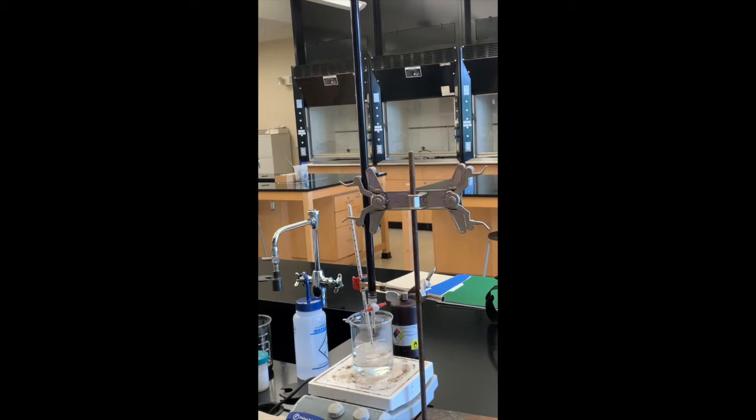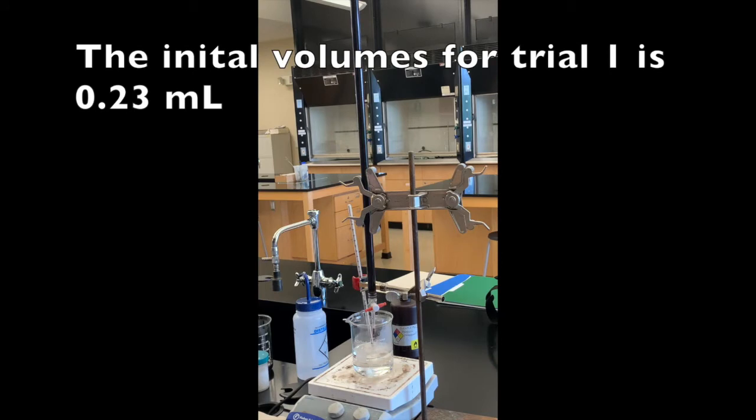Our solution is about at 60 degrees so I'm going to leave my thermometer in there to monitor the temperature while I'm still titrating. I have taken the initial volume and I'm ready to titrate this first sodium oxalate sample. The initial volume in our burette is 0.23 milliliters.